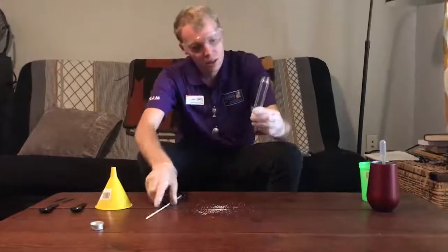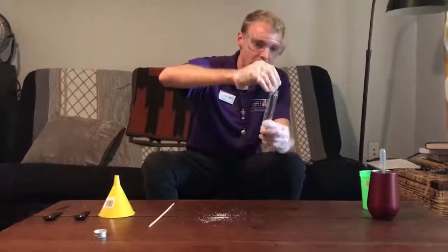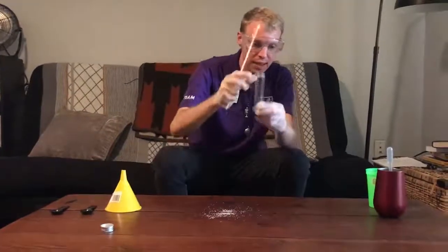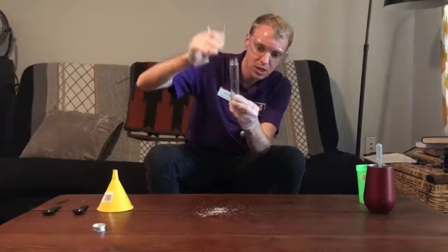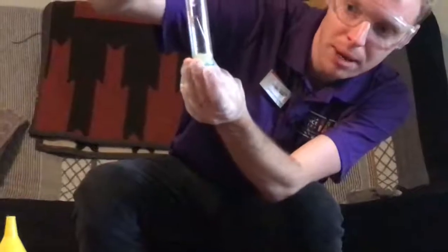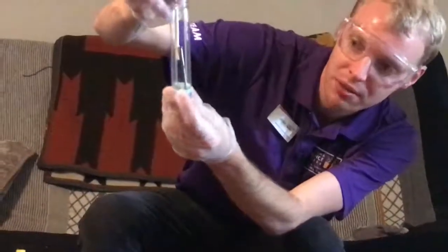And then I'm going to take a nail, and this is an iron nail, which is important, we'll get to that later. I'm going to drop it in just like that, and then check to make sure that it has gone through, poked in a little bit further, gone through my first layer of cotton and into the white part, right? So you use the black Sharpie line, that's the bottom of the top layer of cotton.